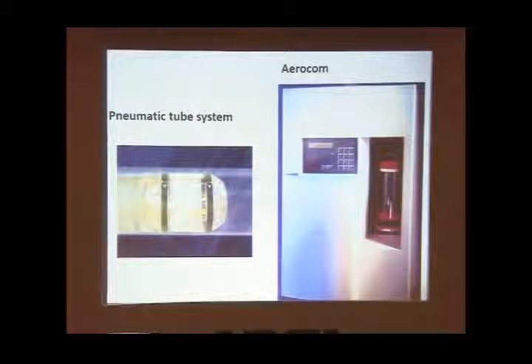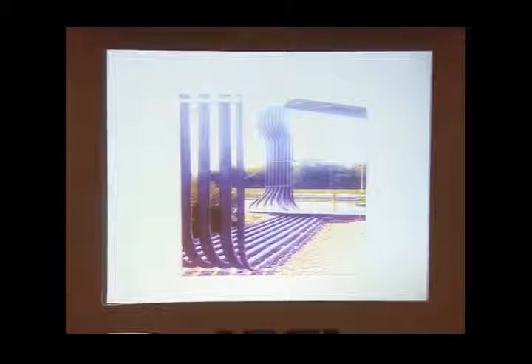And here is a pneumatic system which we use in CMC, but there are also other pneumatic systems where you put your tubes into these canisters and press the destination. It travels at a very rapid rate and reaches the destination. So wherever your lab is, it will go and reach the laboratory. This kind of pipelines are laid all over the hospital or your lab, and this is where the canisters travel through.